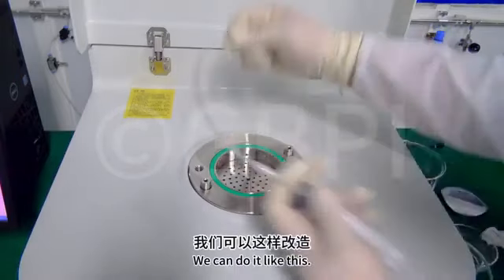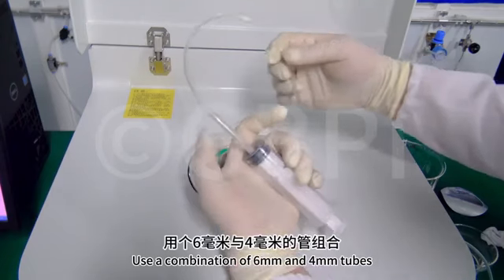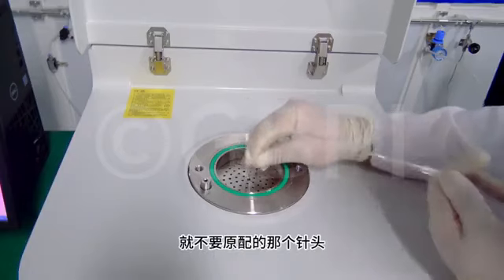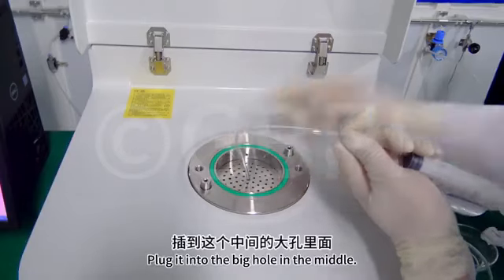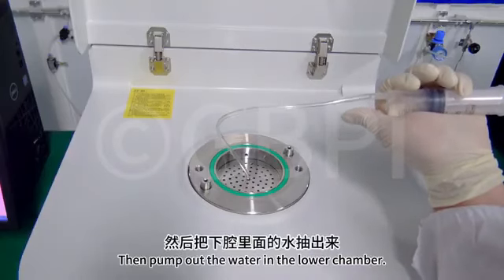We can do it like this. Use a combination of 6mm and 4mm tubes, without the original needle. Plug it into the big hole in the middle. Then pump out the water in the lower chamber.